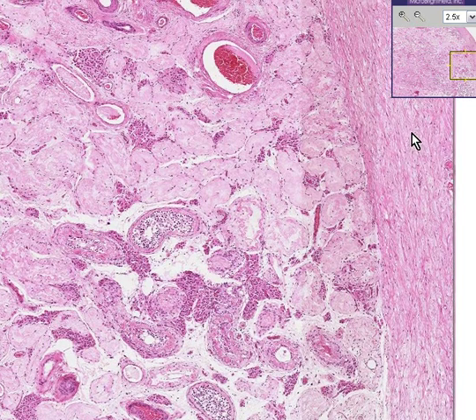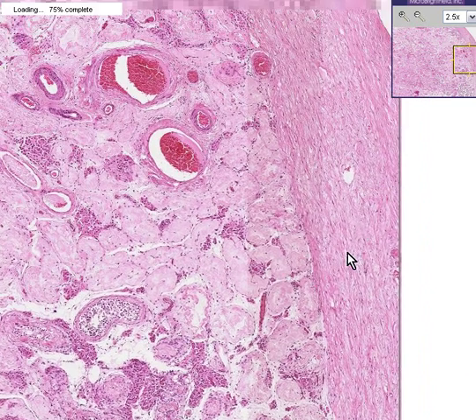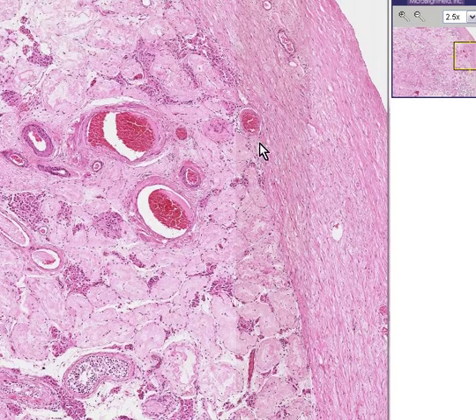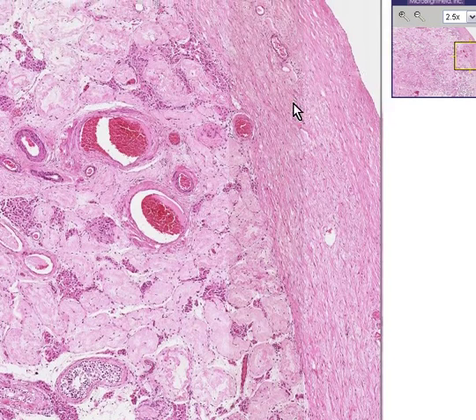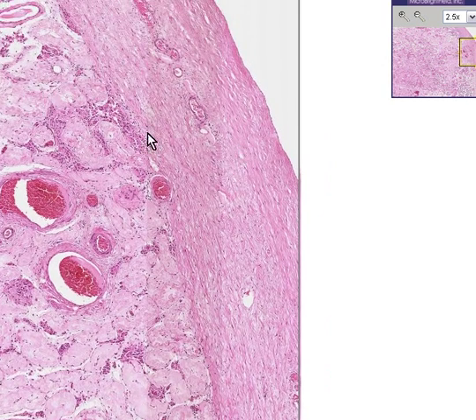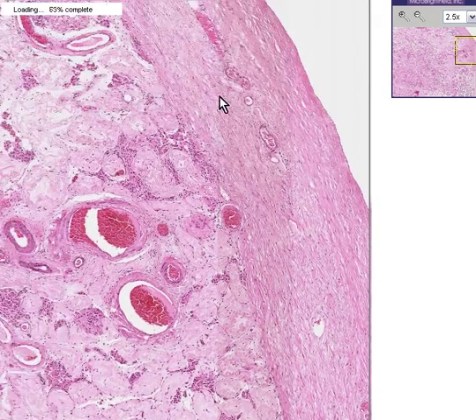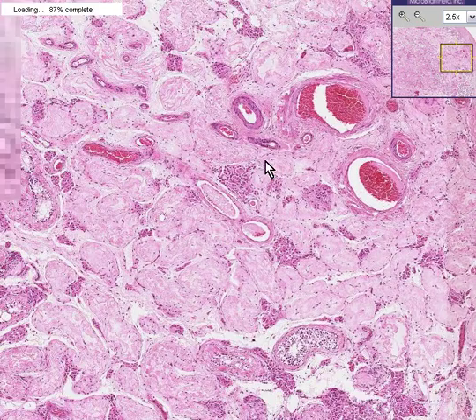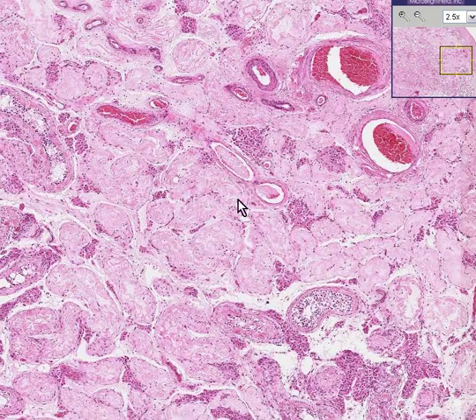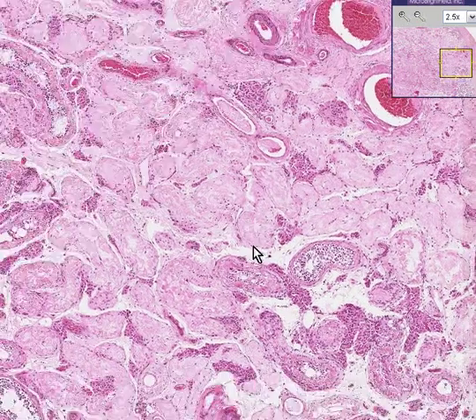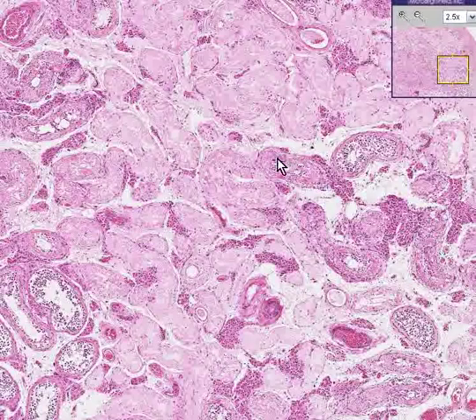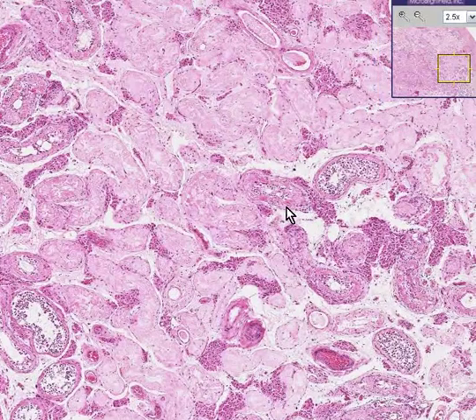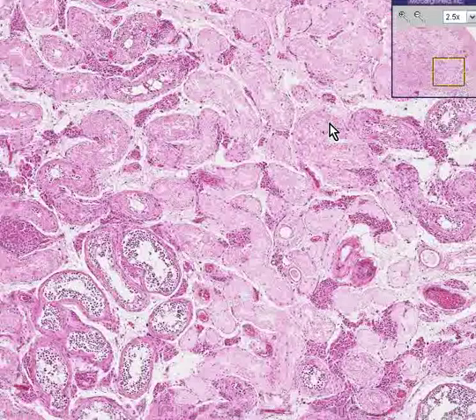What can you recognize this organ to be? Well, peripherally here, there's a thick fibrous capsule, and in the parenchyma, or body of the organ itself, you can see structures that look like little tubules.